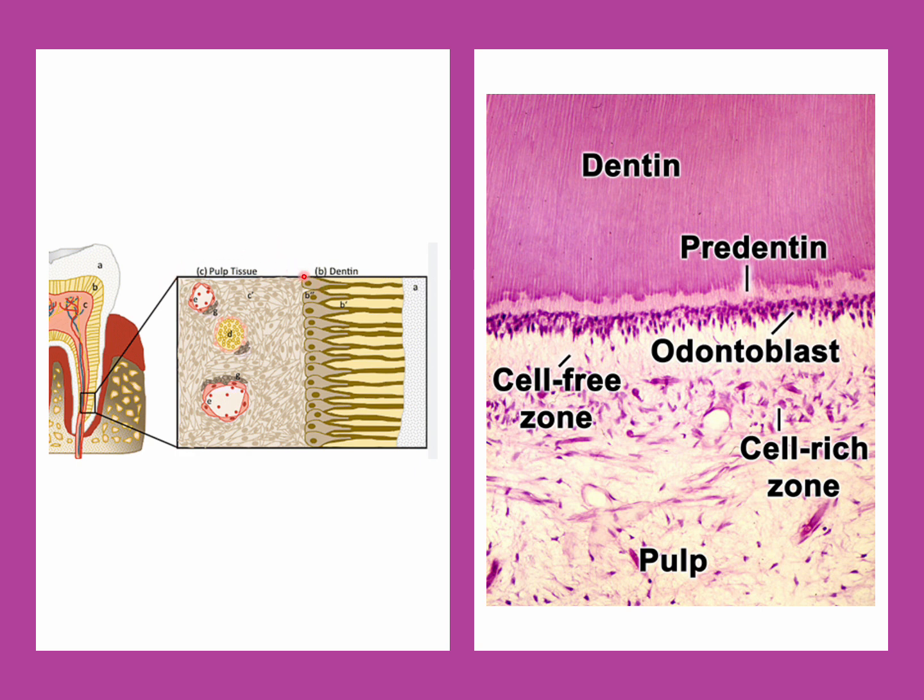And we have discussed that this loose connective tissue has different kinds of cells, fibroblasts, immune cells, and inside of it we can see capillaries and nerve tissue, and also lymphatic tissue, which is not easy to see. So we are going only to discuss the blood supply, or the capillaries, the nerve tissue, and this loose connective tissue of fibroblasts and extracellular matrix.